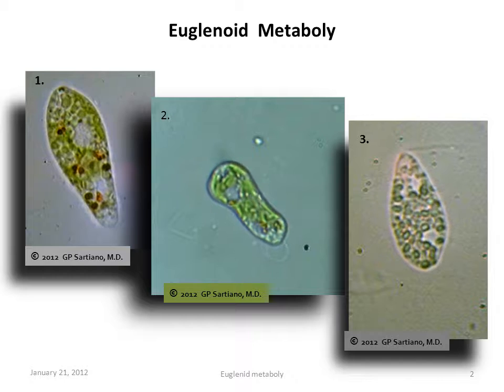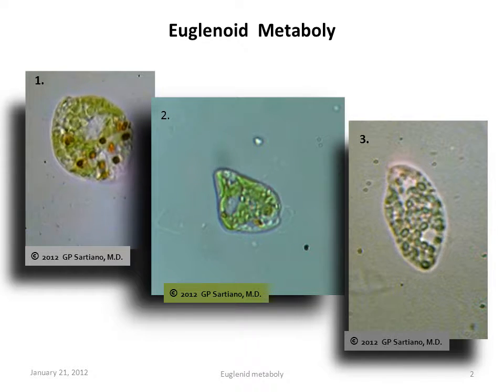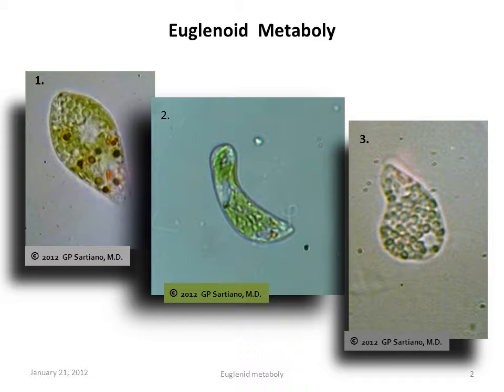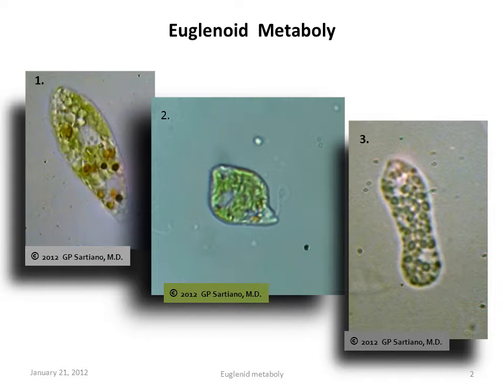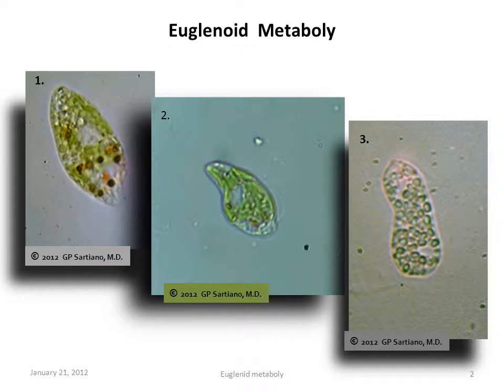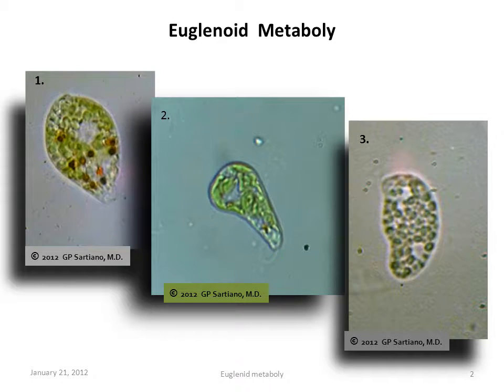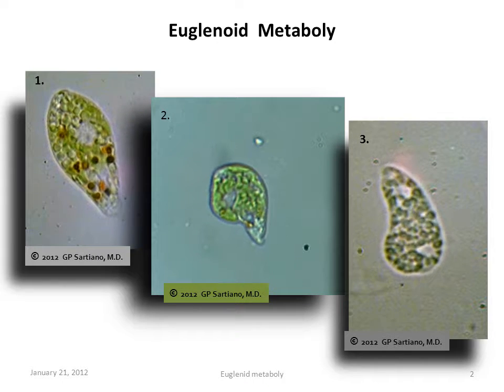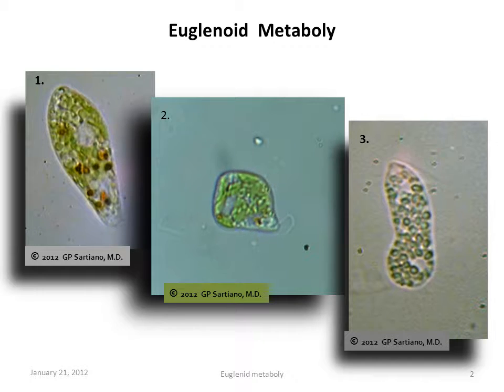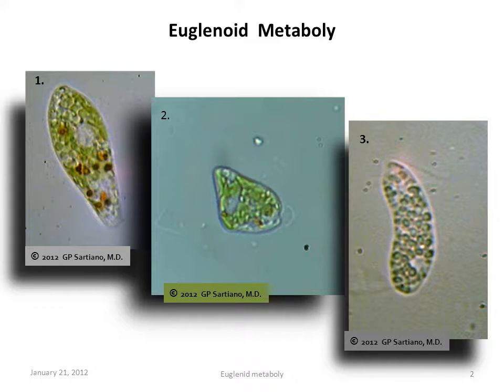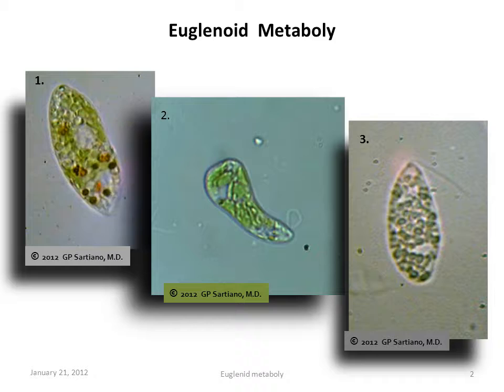Here are three additional examples of metaboly in euglenids. Note that an eye spot can be seen in examples 1 and 2, and the locomotor flagellum can be seen in examples 2 and 3.